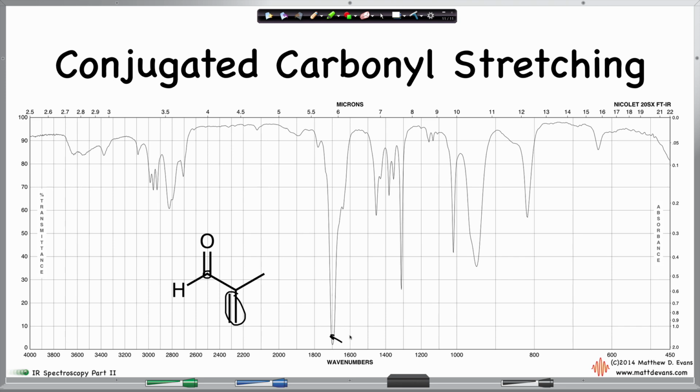This is definitely the carbonyl that we're looking at, and the fact that it's conjugated makes it shift over slightly in the spectrum. I'm taking a wild guess, but I think this is also the overtone right here, although it's a little bit tinier than the previous example. Okay. All right, so conjugation also affects the value.